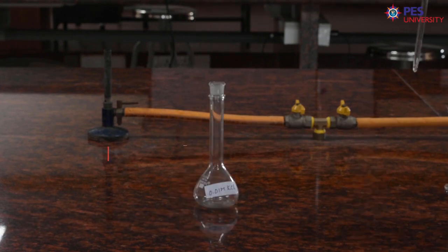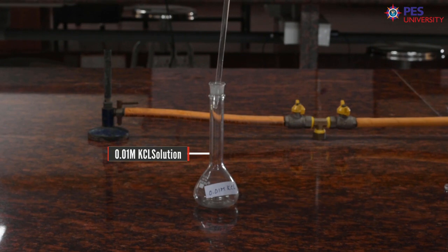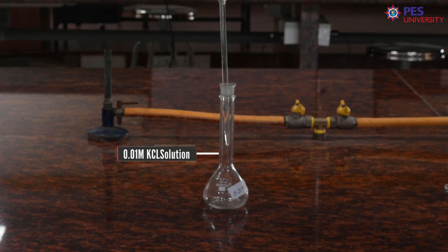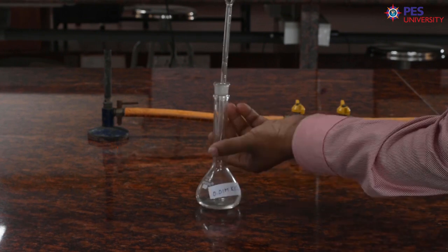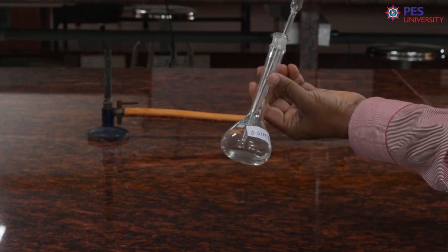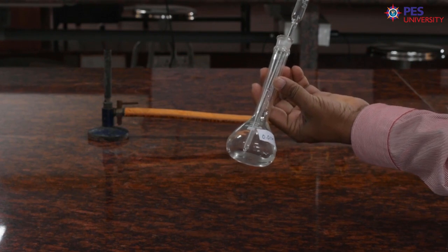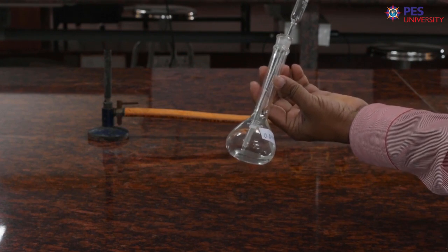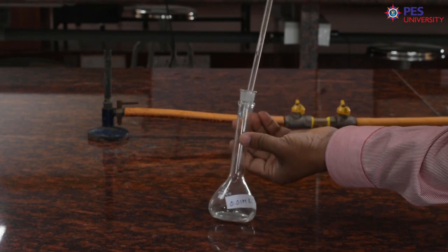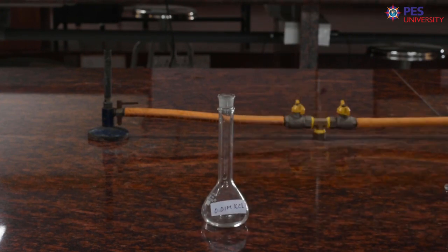After pipetting the solution, transfer this solution into another 100 ml volumetric flask. To transfer even the last drop in the pipette, just touch the tip of the pipette to the bottom of the flask like this, so that all this KCl is completely transferred into the 100 ml flask.